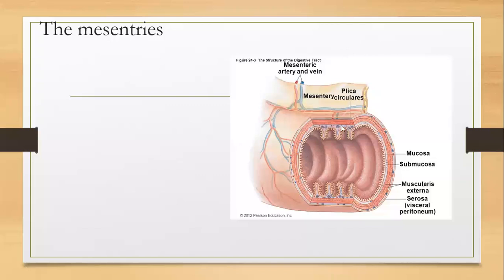Now, from the submucosa, the next layer we are going to see is the circular muscles. And you can see that in this area where I have a longitudinal section, the circular muscles have been cut and you can only see their cross section. However, in this cross section, you can see the elongated cells which are arranged in a circular manner.